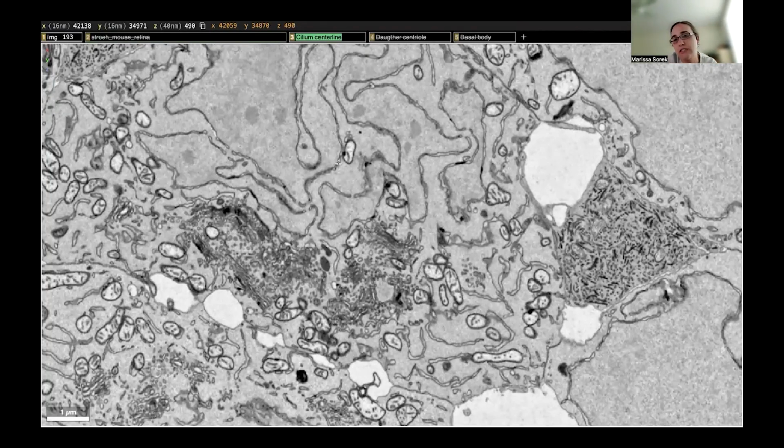That's a great way to cut down on some of those little pieces that you might be seeing out of the cell. And right now, while Celia is looking here, we'll start looking at the different areas where we see those crowded Golgi spots that she mentioned earlier as well, for where to find the cilium.